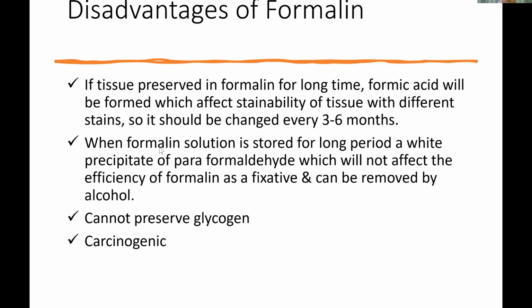When formalin solution is stored for a longer time, it can cause a white precipitate, so we cannot store the formalin for longer periods of time. And formalin also cannot preserve glycogen. That's why when we get adipose tissue, for example lipoma, a lipoma is an adipocytic tumor, adipose tissue contains a lot of glycogen, right?